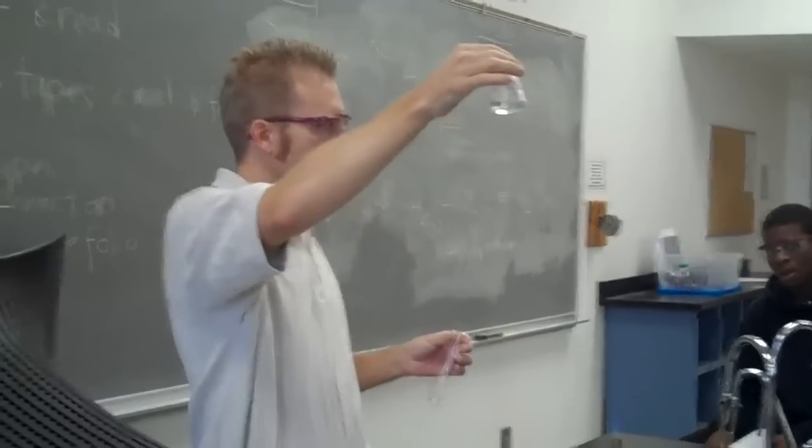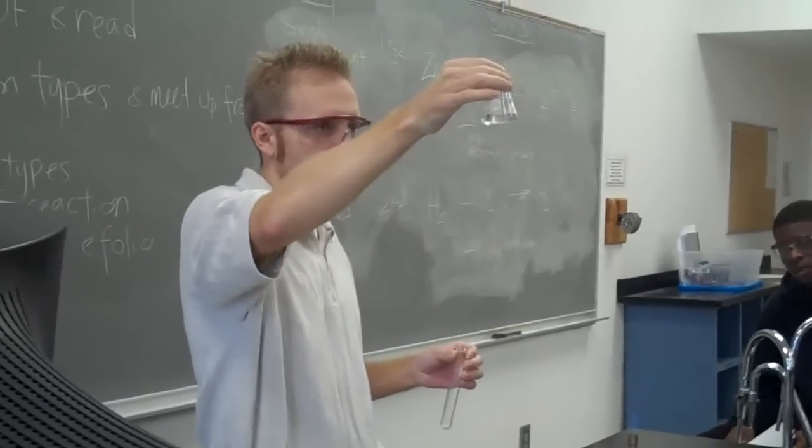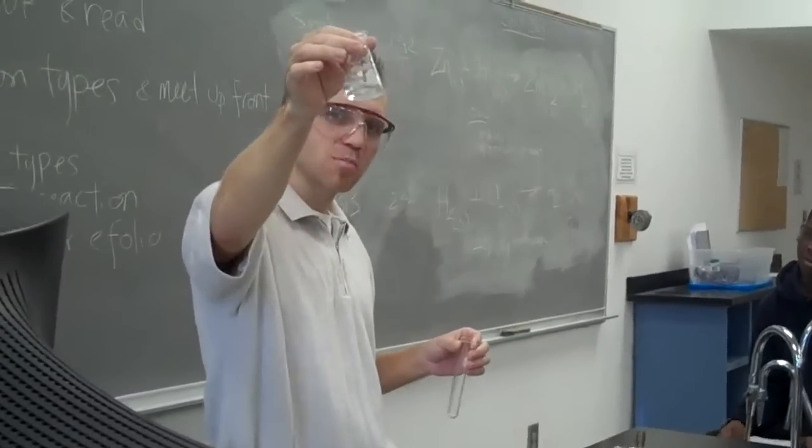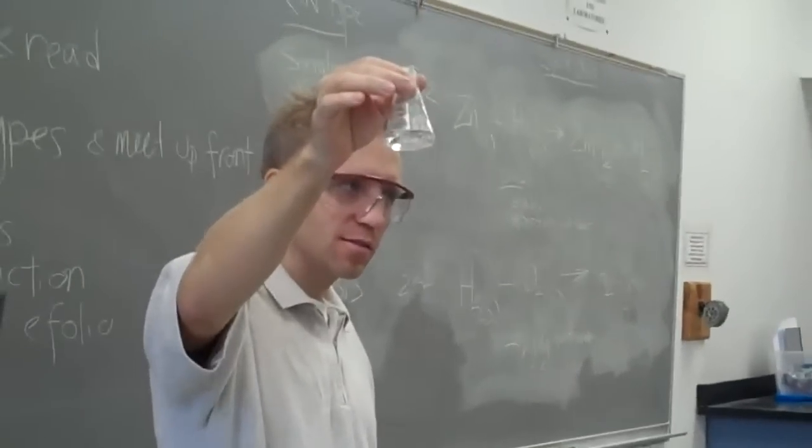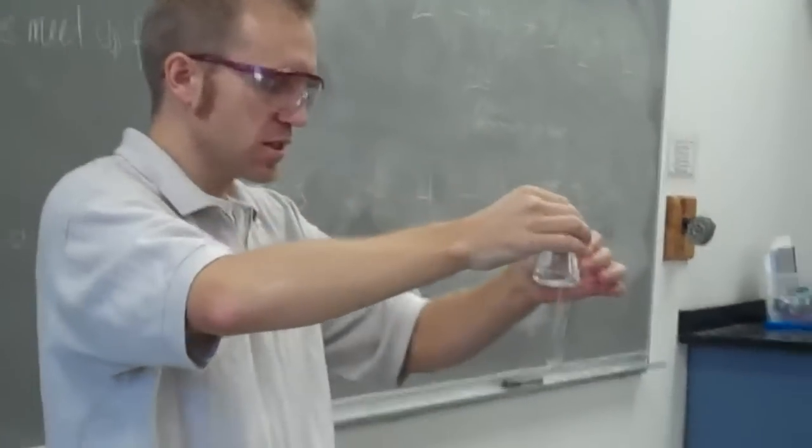Here is the very strong, very concentrated acid. It's a 6-molar hydrochloric acid. I'm going to go ahead and put it in this test tube, and I'm going to make sure that I don't spill on my fingers.